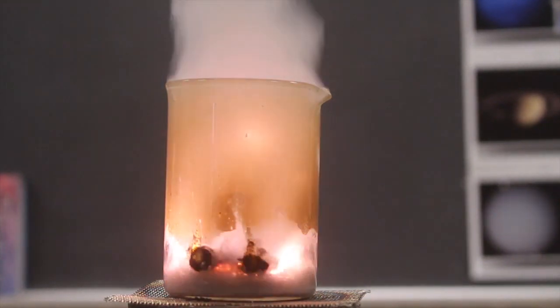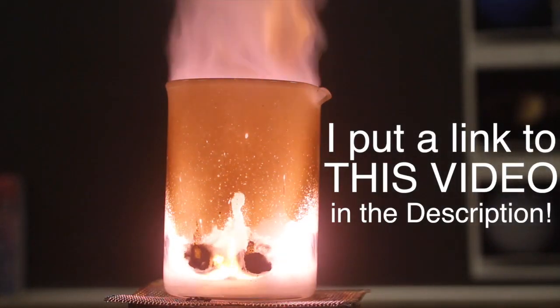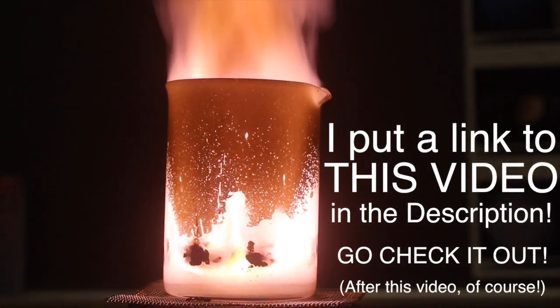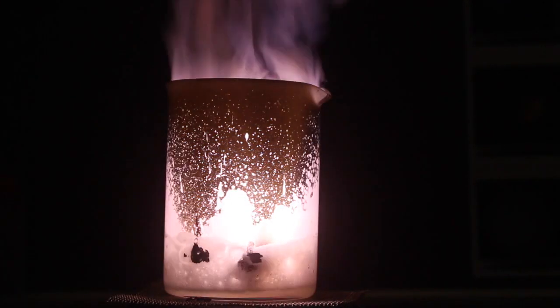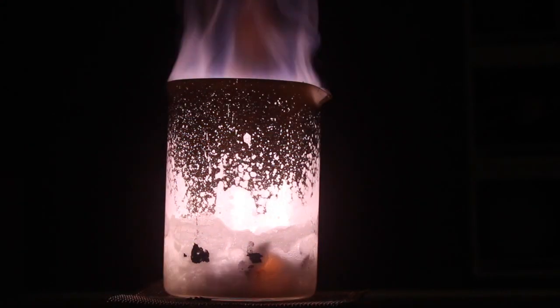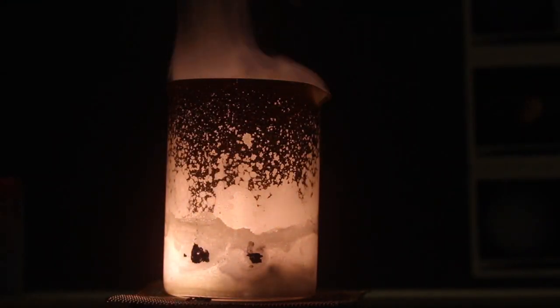Holy cow! Wow! Holy crap! Wow! Once the reaction takes off, we should have a fire.